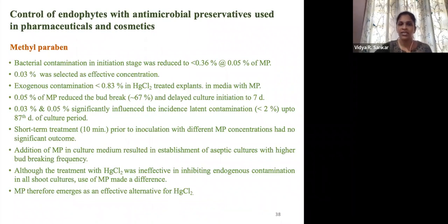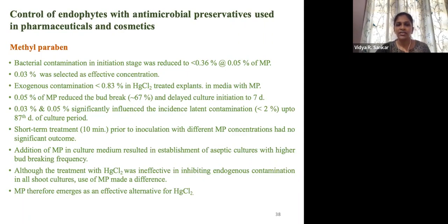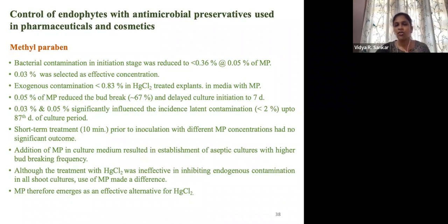Other chemicals selected for contamination control are preservatives commonly used in pharmaceuticals and cosmetics, such as methylparaben. We found that 0.03% of methylparaben is very effective and can be used as an alternative for mercury chloride. It can be used in two ways: the same way as mercury chloride treatment, or we can add it to the media itself. Three chemicals selected from these categories are methylparaben, benzalkonium chloride, and thimerosal. Thimerosal and methylparaben can be used as additives in the media and the media can be reused for the next stages also.